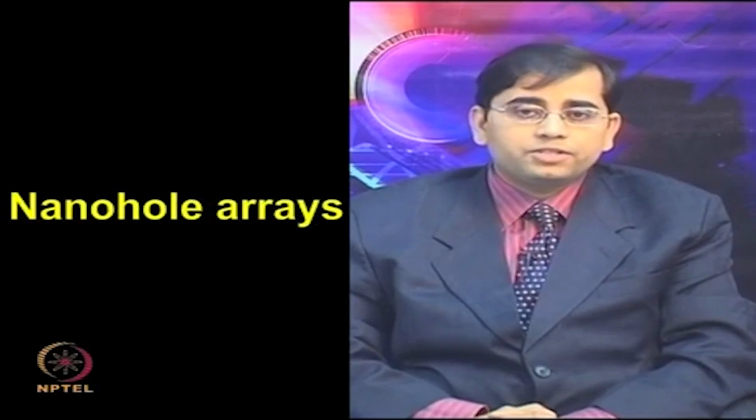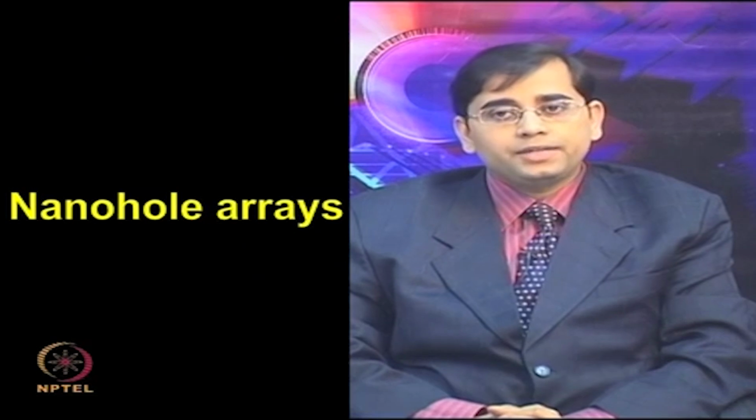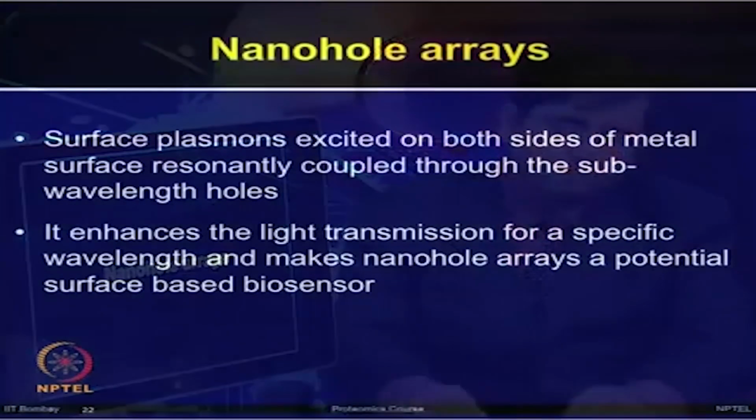Now, let us talk about another technique which is also based on the SPR principle, which is nano hole arrays. The nano hole array technique utilizes label free detection of biological binding events in a very high throughput manner with temporal and spatial resolution.